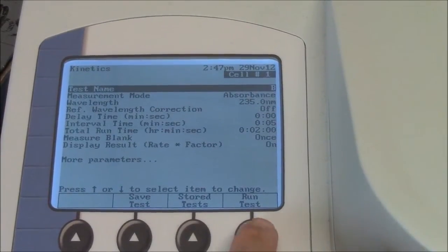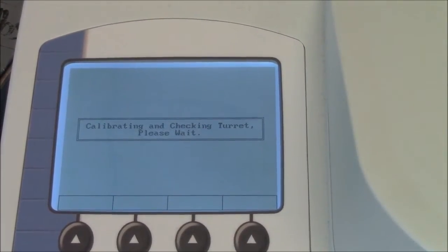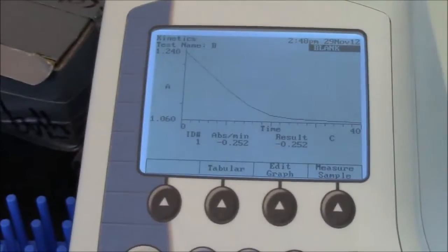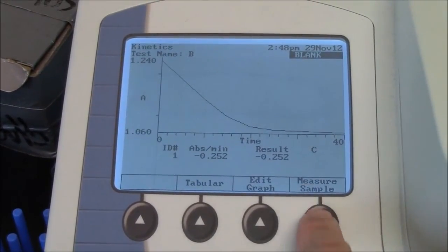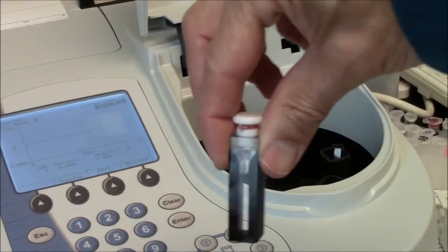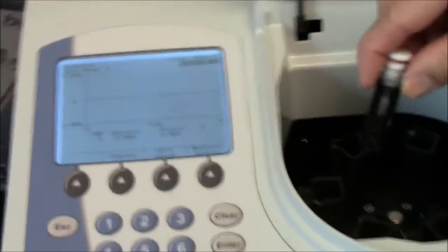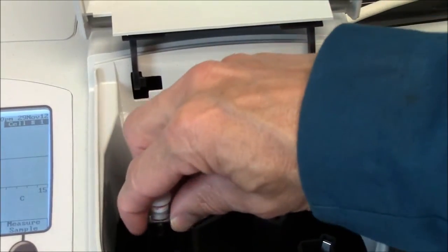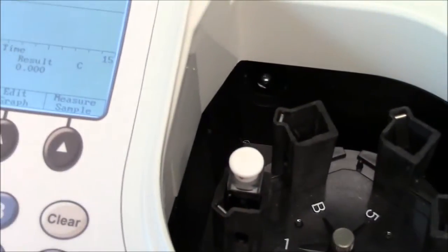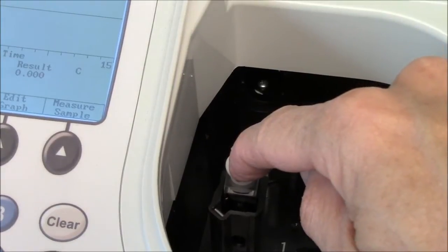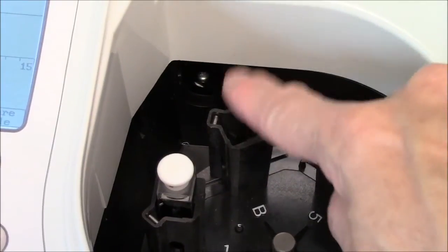When everything is set up the way I want it to be, I click Run Test. It's checking the turret. So now, when I'm ready to run my experiment, I click on this button, but I need to be ready first. Here I've prepared my cuvette — it has ampicillin and buffer in it. Instead of running a baseline of this cuvette, the spectrophotometer is going to compare the absorbance of the cuvette in slot 1 versus whatever's in slot B. So I'm just going to use an air baseline — there's no cuvette here.